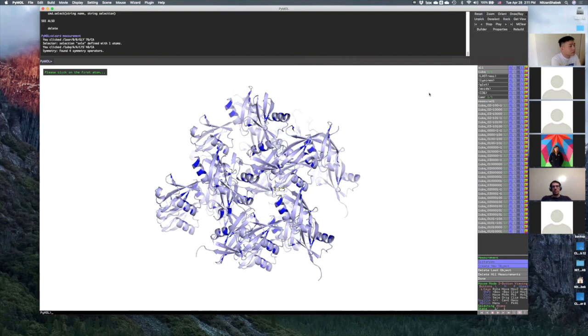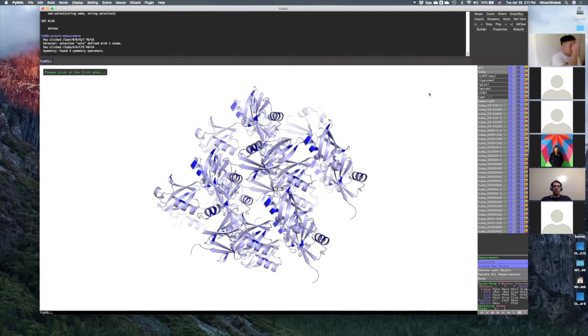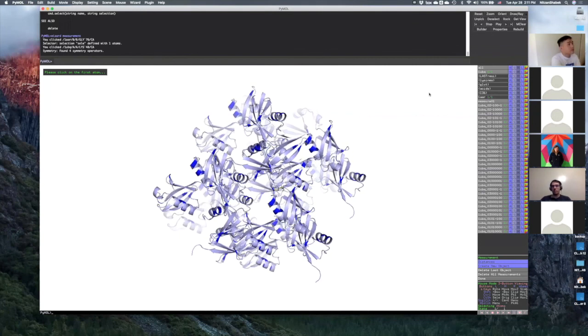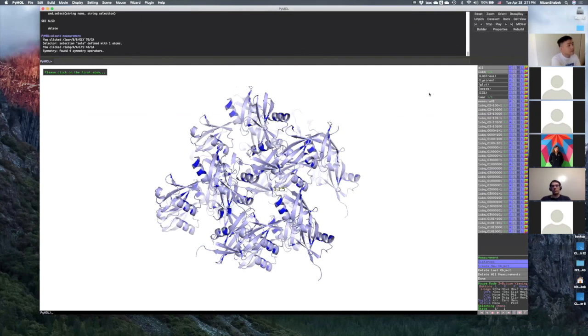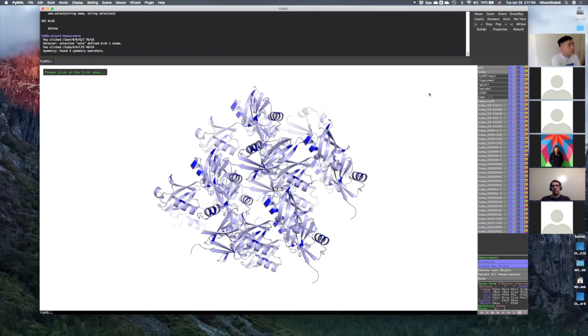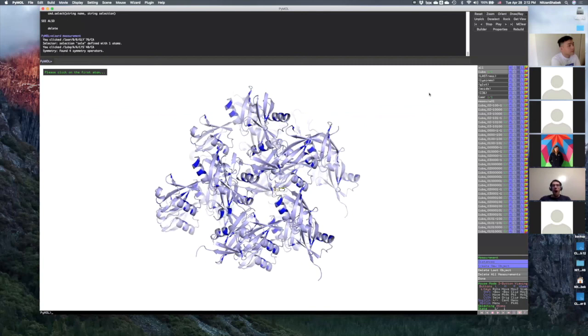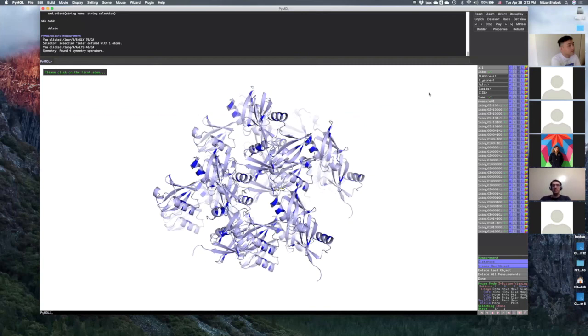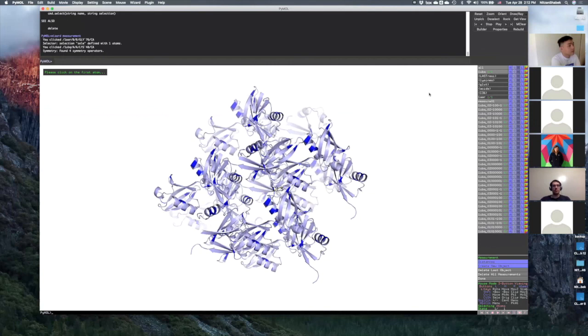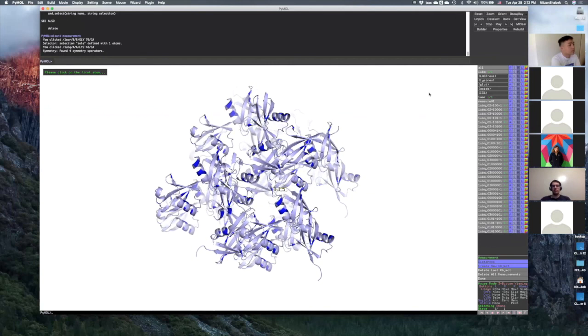So that was just an entry-level introduction to PyMOL: how to fetch a model, how to use the mouse, and how to color different parts, how to take advantage of this software, and just give you a real flavor of what you can do with it. So we played a little bit with how to look at different features like cartoon and amino acid.